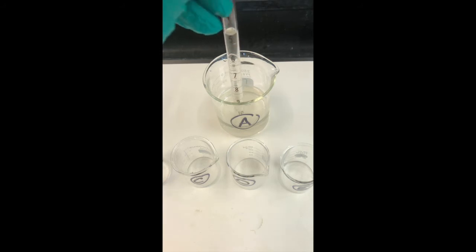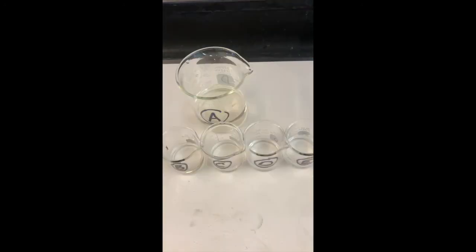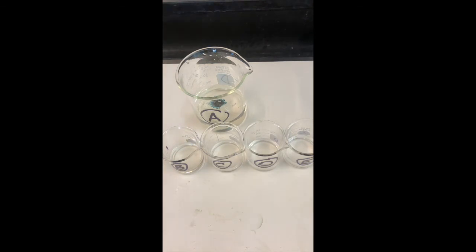You're going to go through and add your sugar stock solution first, and when you're done adding that, you're going to rinse your pipette through with water and add the water additions. It's extremely important to follow the guide on the chart for adding the drops of food coloring. Make sure to only add 1 drop of blue, 1 drop of green, 1 drop of yellow.